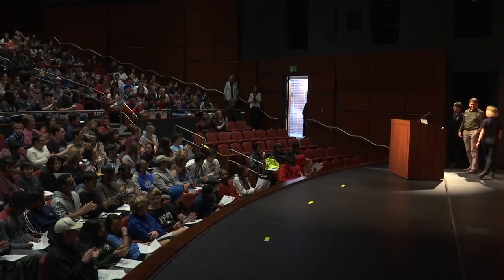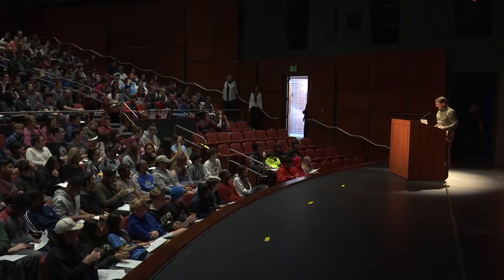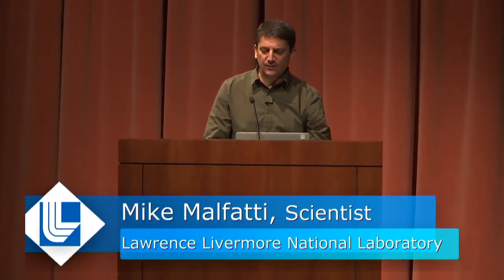All right, you ready? All right, well, thank you, and good morning. Today we're going to talk about accelerator mass spectrometry and how we're using it in the biomedical field to solve human health problems.